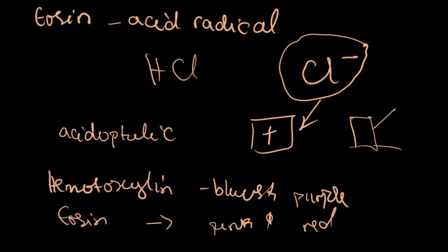Because white light is made of this spectrum of colors, by refraction and diffraction we are able to actually see these colors under the microscope. However, in electron microscopy we make use of electron beams, and these electron beams, unlike light, do not have a color spectrum.